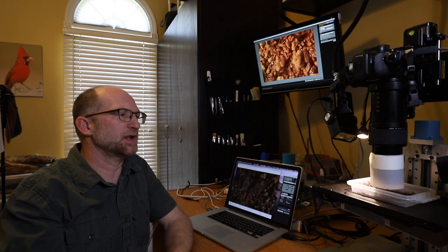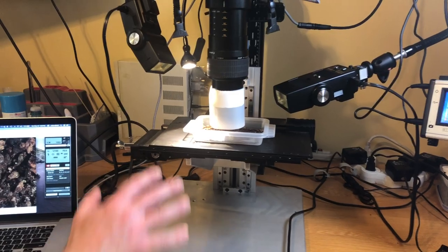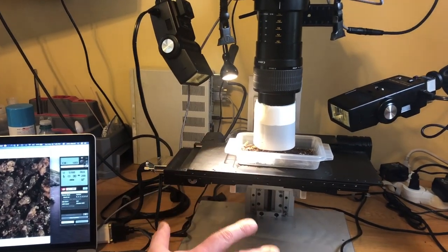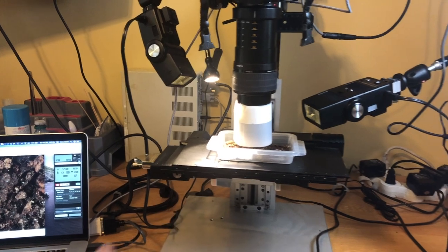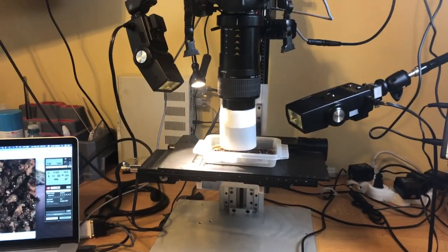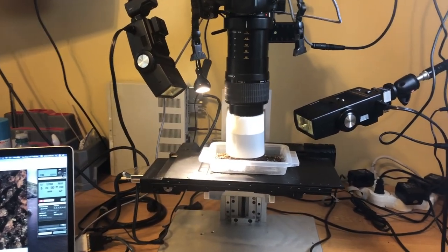This was years ago, so they may make this kind of thing much cheaper now and more readily available. I'm really not quite sure. But basically, this is an automated XYZ stage. This particular one is ProScan 2 by prior.